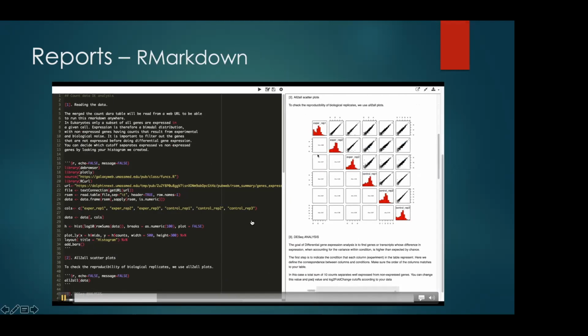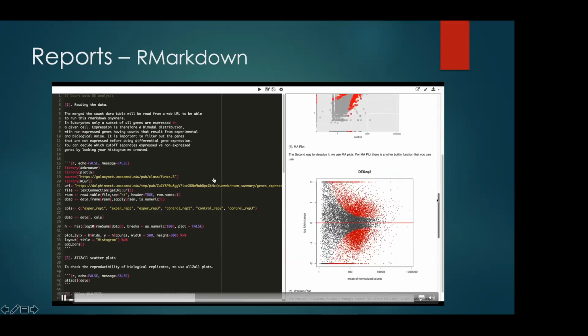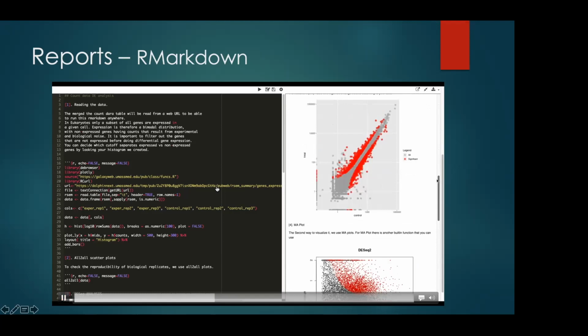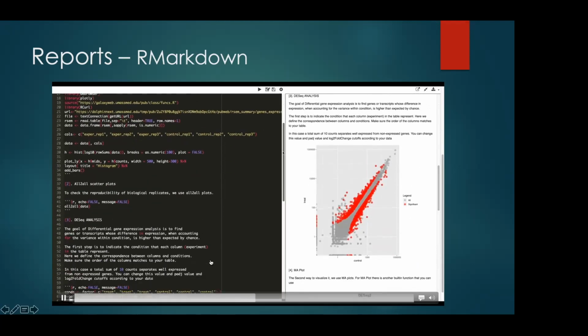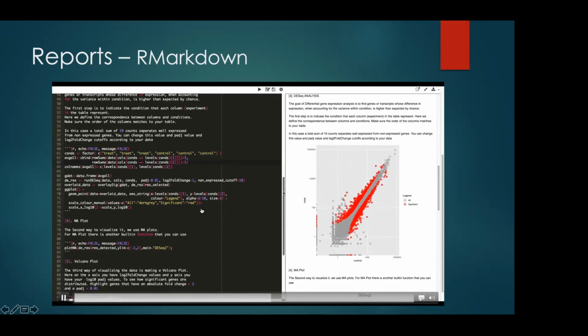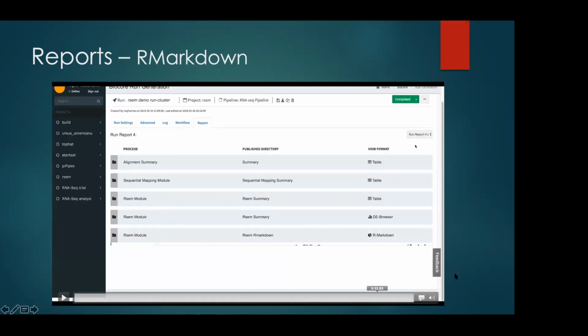The nice thing is when you want to change one of the parameters on this left side, you can do that. As an example, I'm going to change this fold change value. There's a threshold for the log2 fold change value. So I will make it 4 and click this run script. This will execute this code and update the image accordingly. That's how this R Markdown section works.